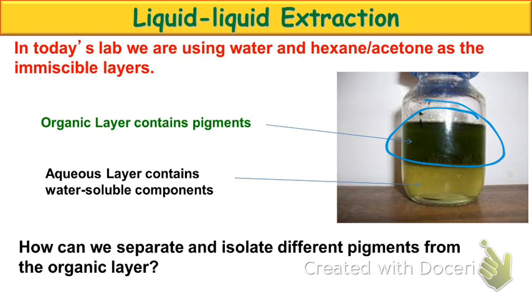Okay? So we're trying to separate a lot of compounds. If we were going to do TLC, how many TLC plates would we have to use? A lot. So all of you working together, the entire organic contingent of students, okay, all of you running 5 or 6 TLC plates could potentially separate all of that. Okay? You could then collect it all and then sell it off as some fancy drug. Okay? That's going to be a lot of effort, a lot of time, a lot of work. Okay? It's just not going to work out very well. So what we end up doing is coming up with a new technique.